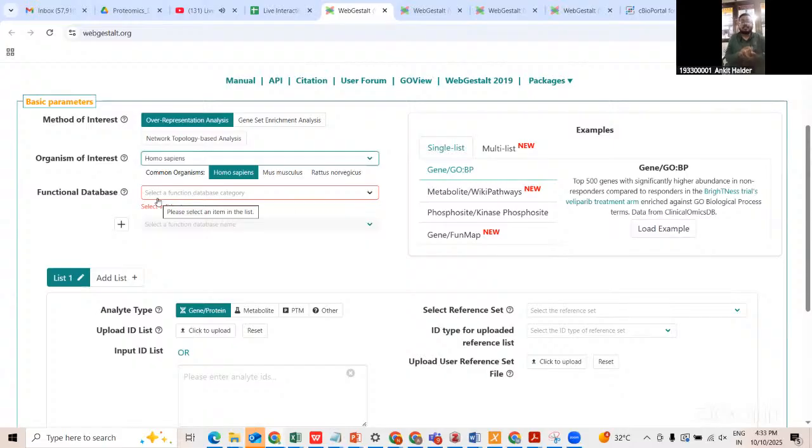As I mentioned, the software or these toolkits are only helping us in curating from the huge reference literature and the databases that have been built over the years, around the globe, by different scientists in different biochemical studies, functional assays, and different pathways that have been known and are present in the database. So this helps us in curating it.